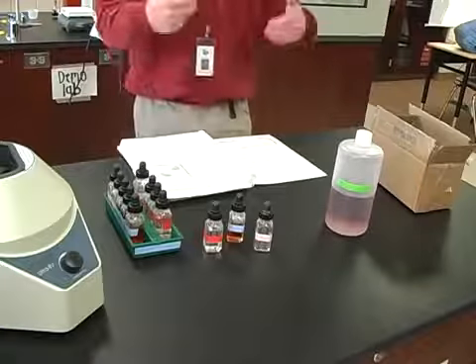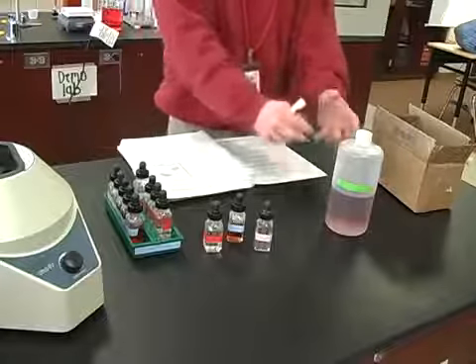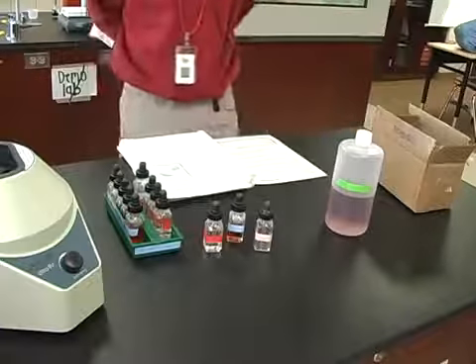So just out of your lab station, grab a distilled water and put your stir rod in there all the time.